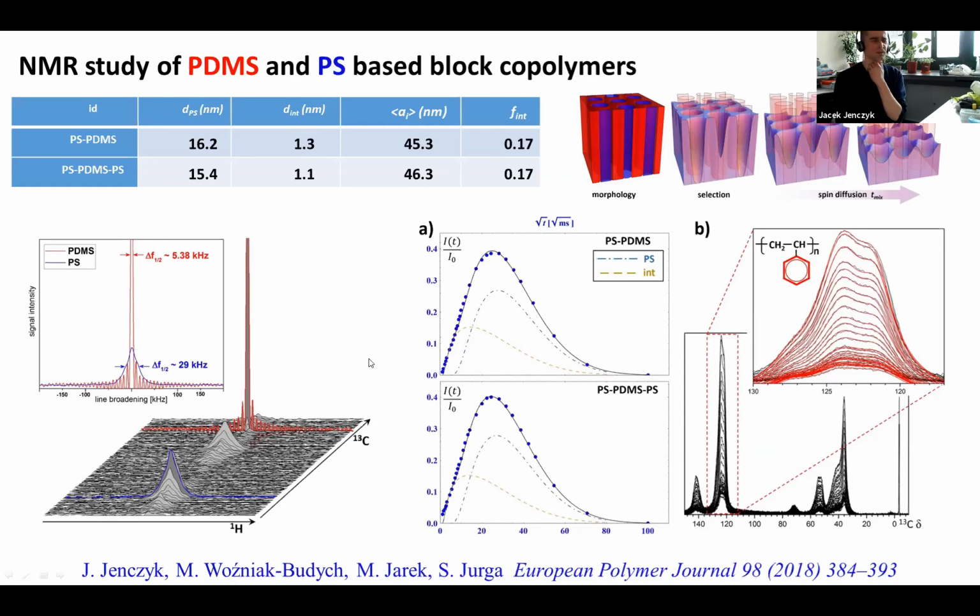This is also the technique introduced by Wolfgang Spiess in the 90s. This is WISE NMR experiments, or wide line separation experiments, where you can nicely separate proton signals using the carbon dimension.